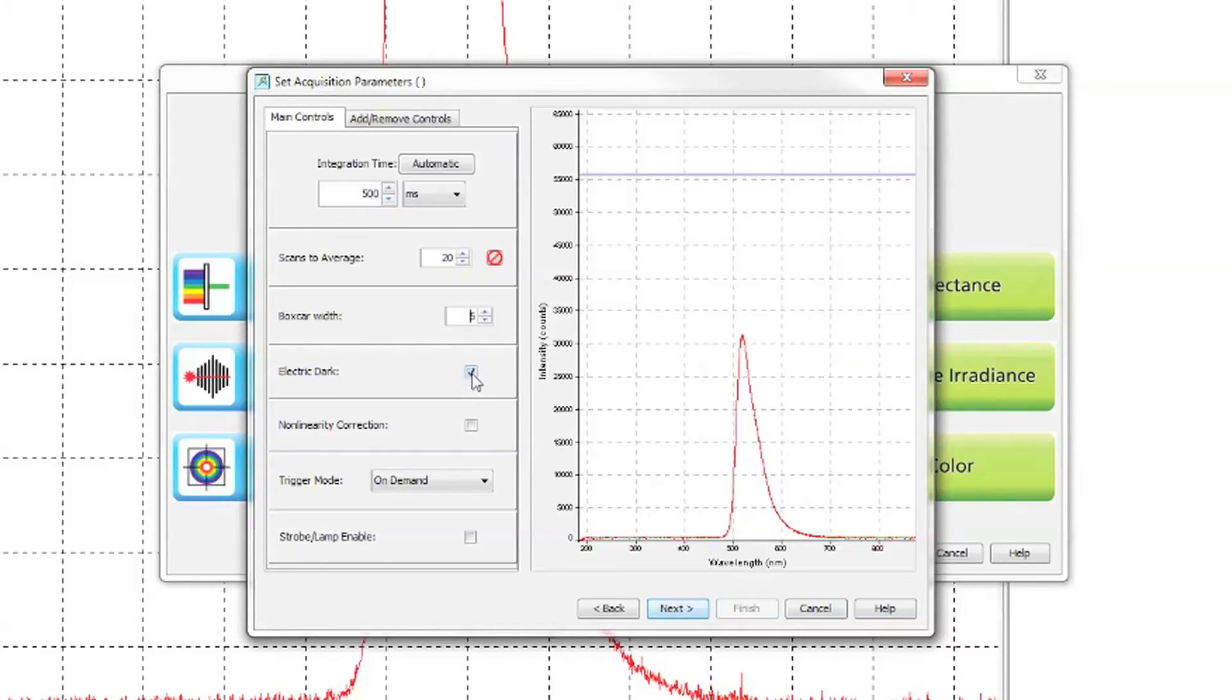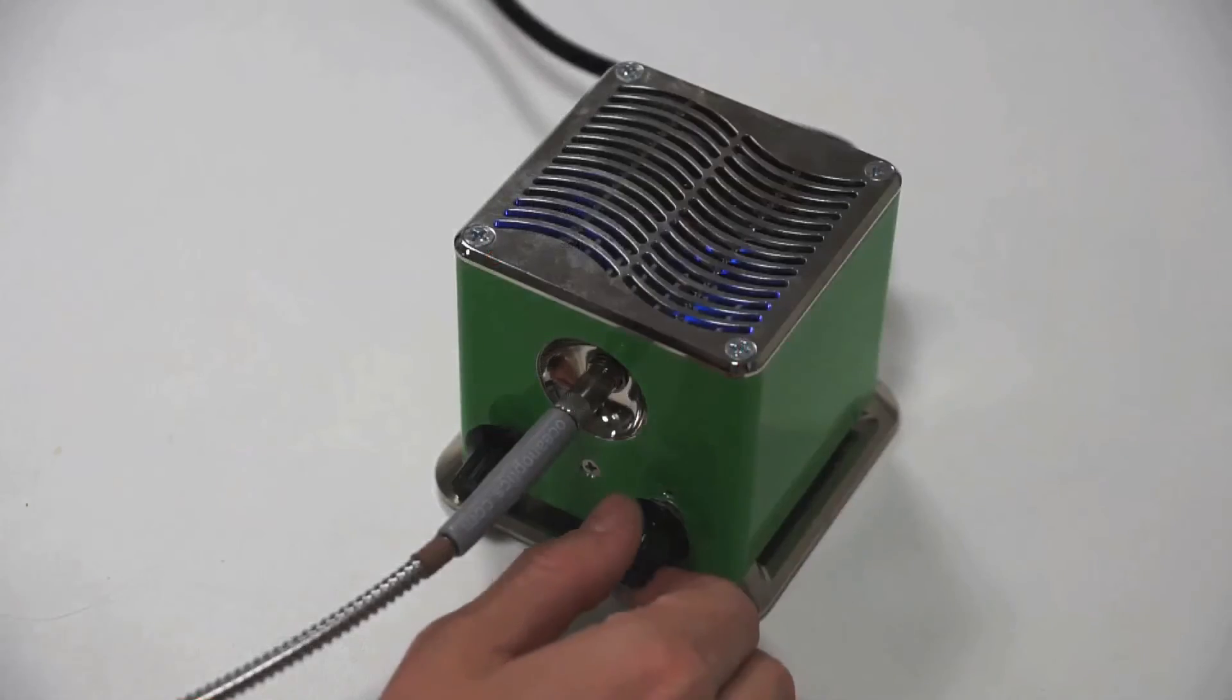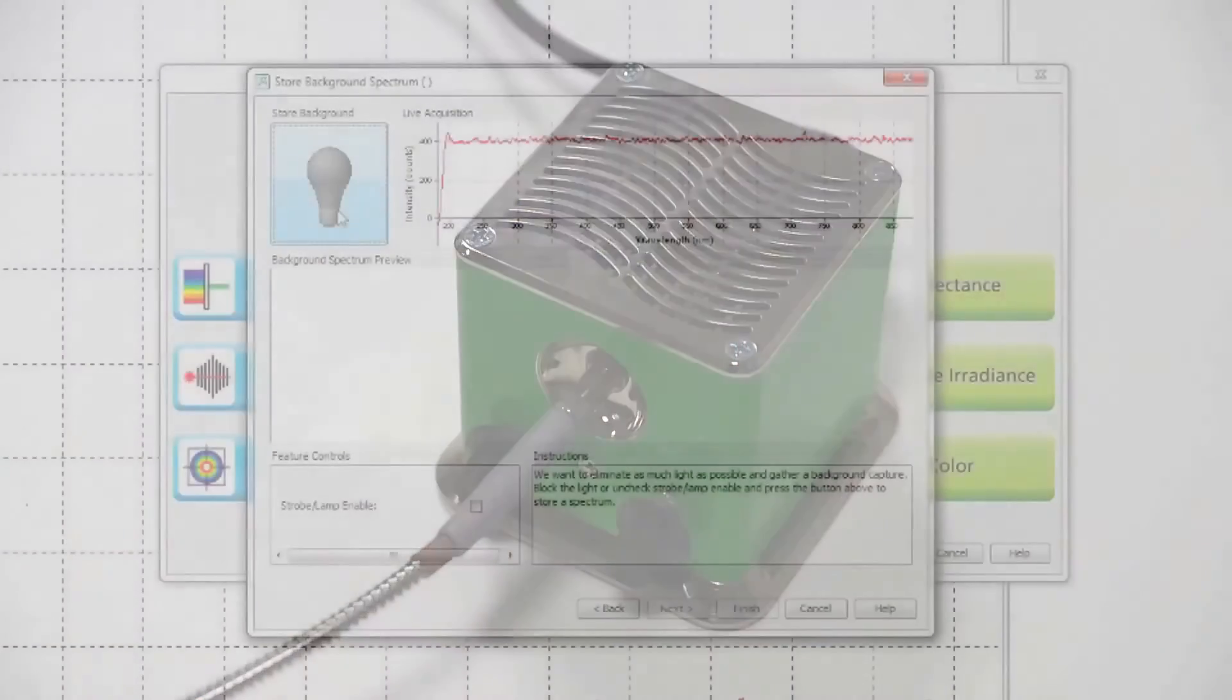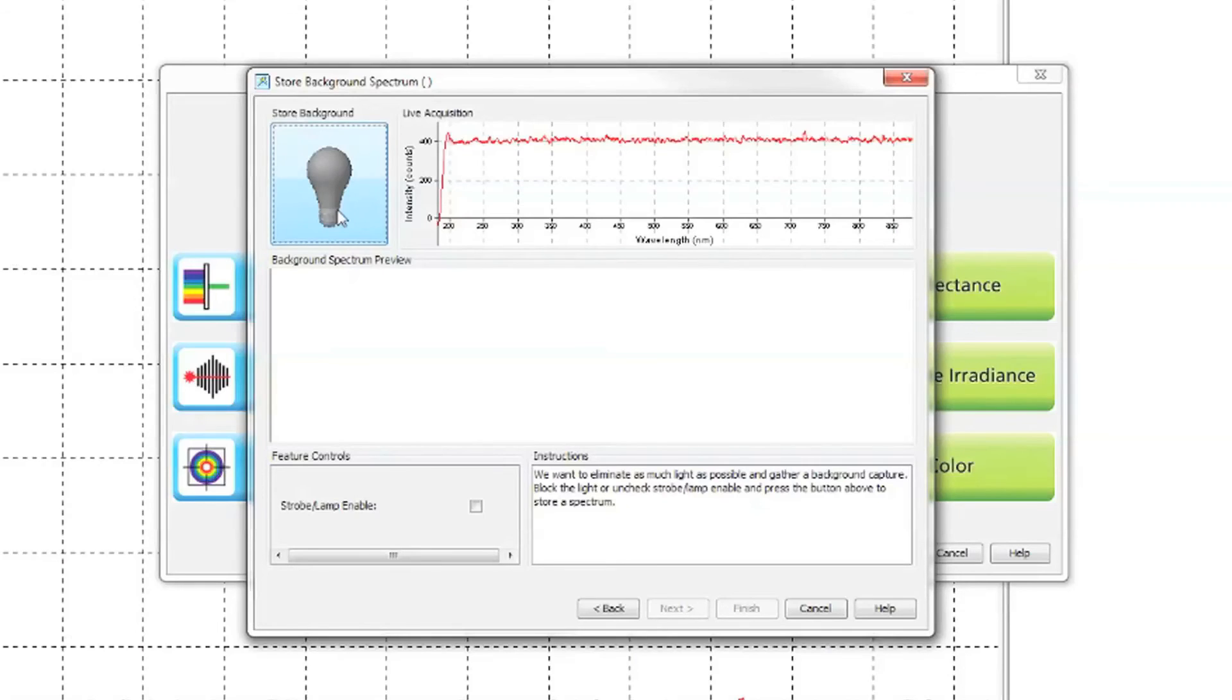Choose whether to select electric dark and non-linearity correction, both of which we recommend to select. Next, you will be asked to take a dark. Do this by closing the shutter or turning off your light source. Click the grey light bulb and then finish.